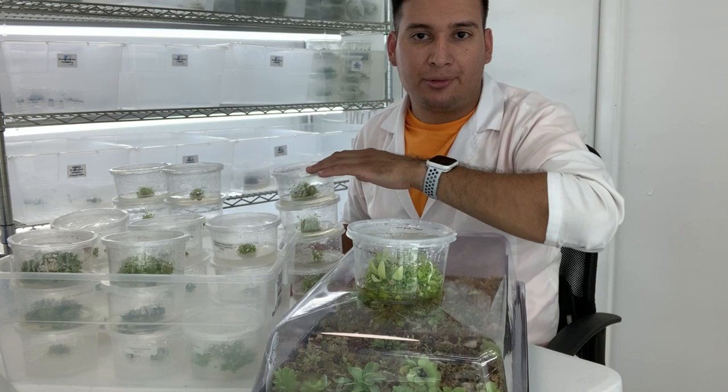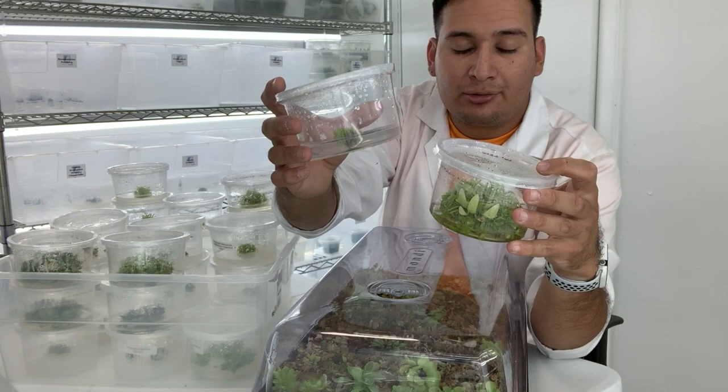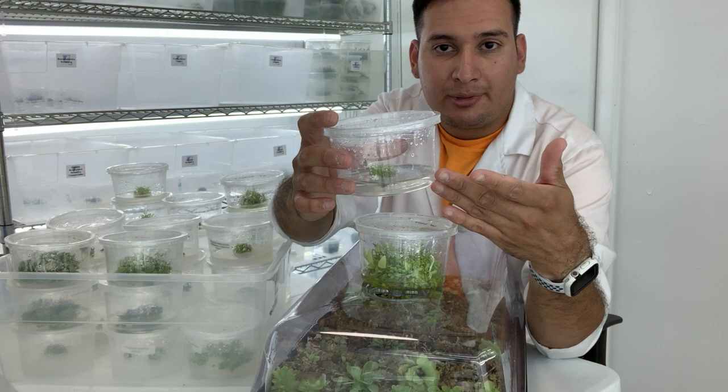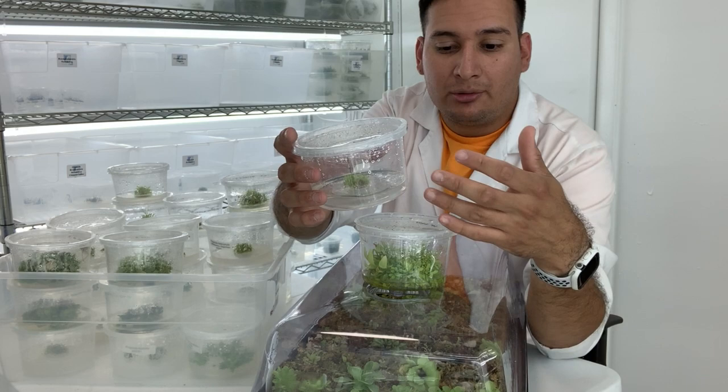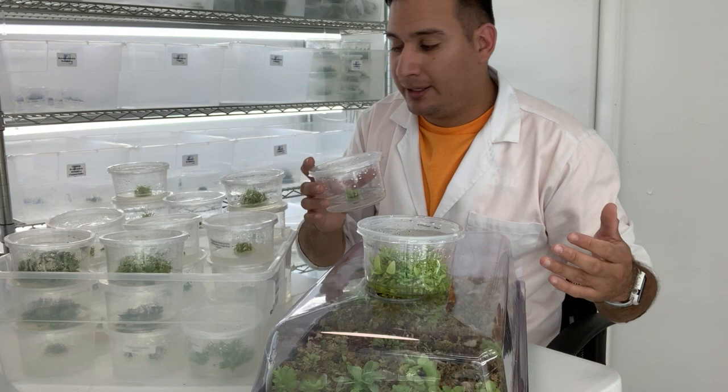It took one day for me to make all the media and place them in the containers. From here — a small clump of probably close to 20 plants — it's going to take close to three months to grow to full size, but you don't have to do anything. You don't have to water the plants; they're already growing in a sterile environment. All you have to do is put some light on them and wait until they grow to size, then repeat the process and place them into soil to sell.